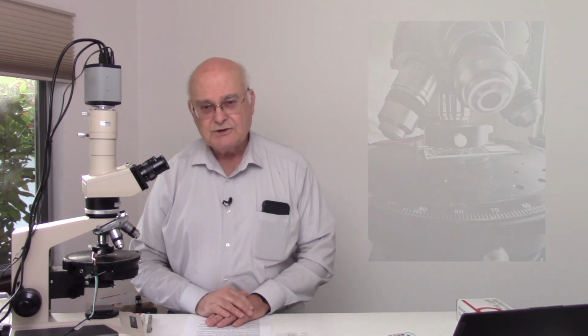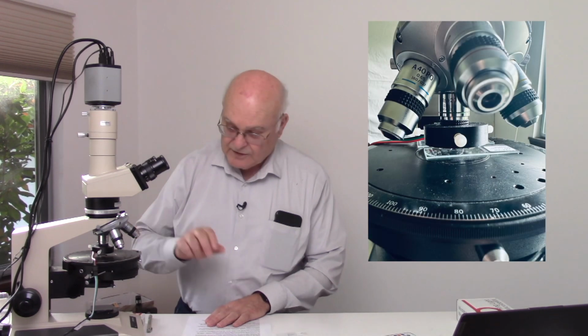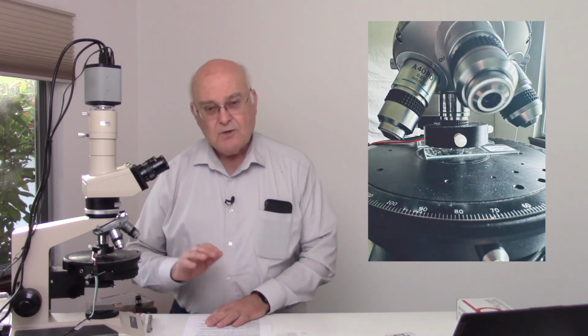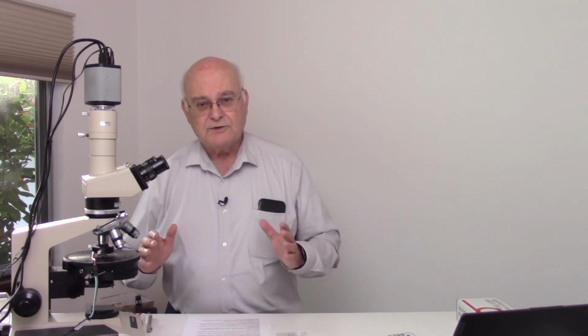We've looked at how we might use the light microscope in terms of illumination systems. We've looked at how important reflected dark field illumination is, and we have an attachment to make any microscope capable of reflected dark field illumination. We've also looked at the importance of oblique illumination, dark field illumination, bright field illumination. Later, we'll look at how we might even use polarized light illumination.